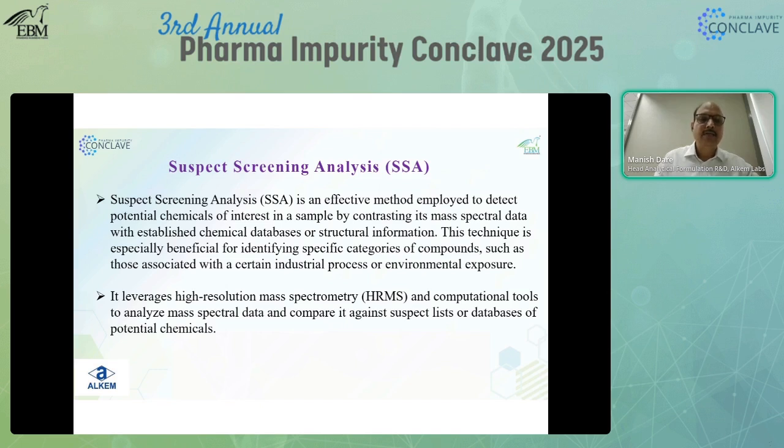So this SSA is clearly suspect screening analysis during method development activity, with the lower limit of the impurity, the response and the unknown impurity limit would be very sensitive. A technique like mass can be used.